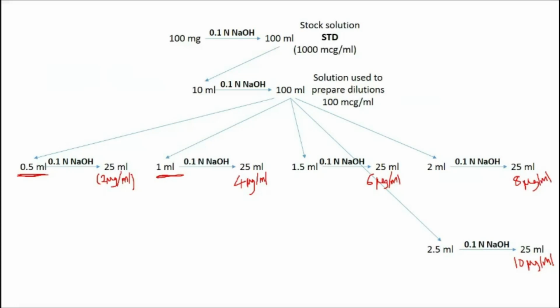Now, any doubt in the procedure so far? This is the procedure you need to follow. If you have no doubt, please copy down this dilution scheme to prepare your standard solution series. So please quickly copy down this entire thing. And those people who know that they are slow, first take screenshot and then start writing.